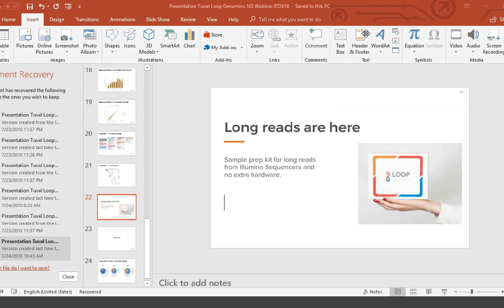Now, I realize that that's hard for people that haven't been doing single molecule sequencing so far. It's hard for them to understand what the equivalent for that is in their regular Illumina short read sequencing. Because, say, for example, now you're doing 1 million reads per sample. How many actual unique single molecules is that? It's hard to tell. You don't really know if that's 1,000 unique molecules or 100 unique molecules. How many PCR duplicates do you have in your data? The difference with our data is that you actually know how many unique molecules you have. So what we're seeing people in the gut microbiome space do is sequence anywhere between 5,000 and 30,000 unique molecules. But obviously that's completely up to you.